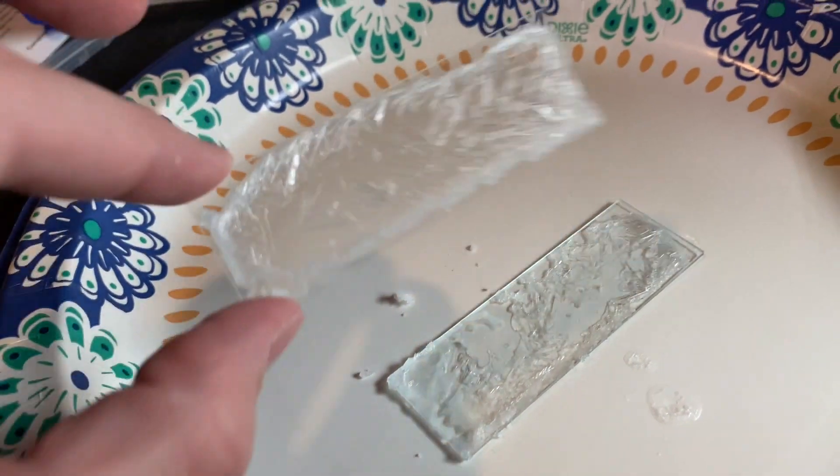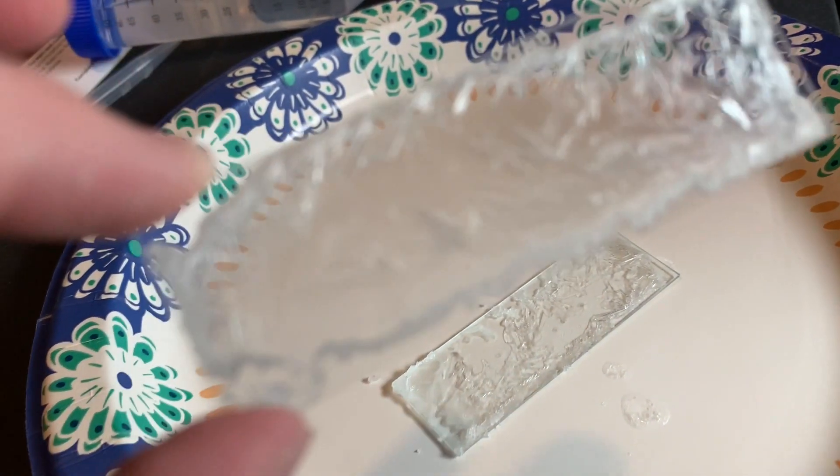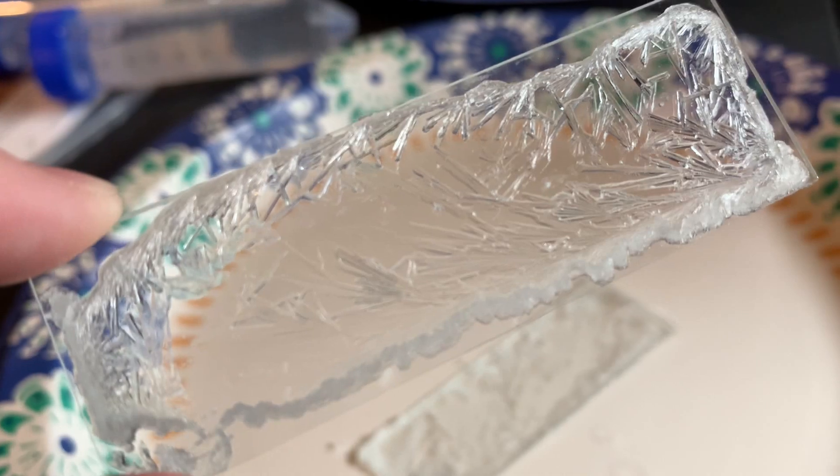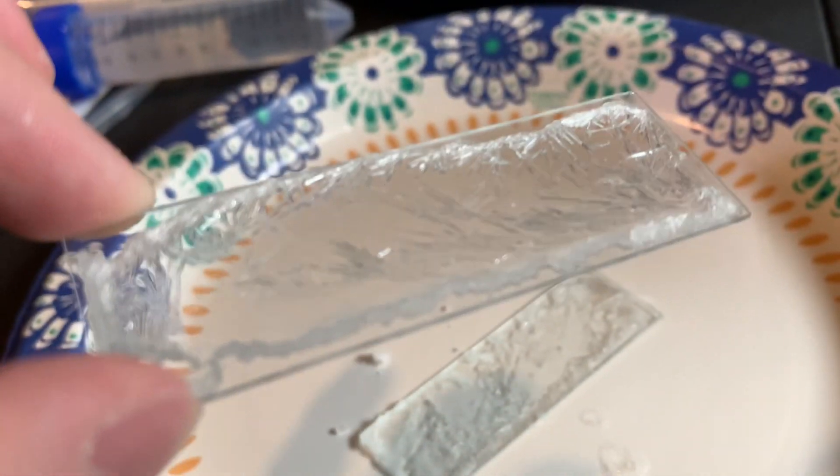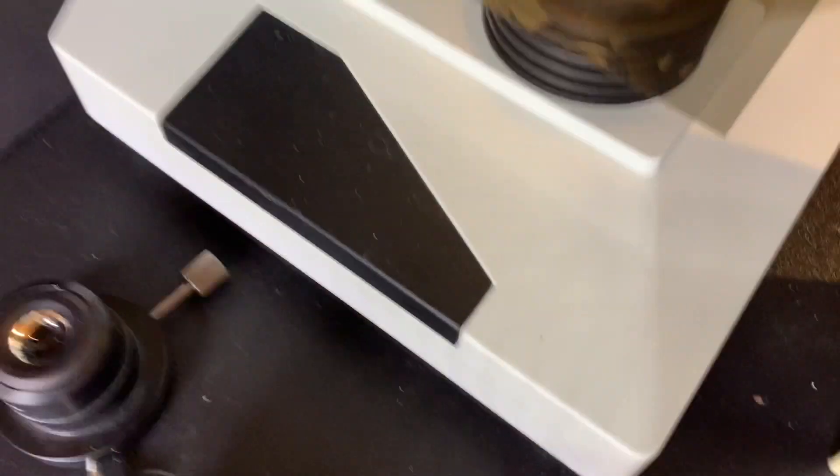So after about 24 hours, this is what I was left with. You can clearly see that this is different than what we had before. These grew very much across the slide, except kind of around the edges where it's a little bit more thick.